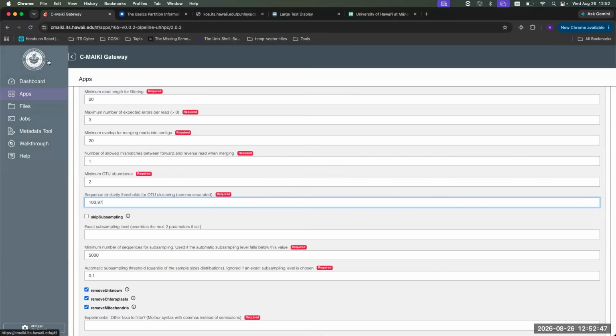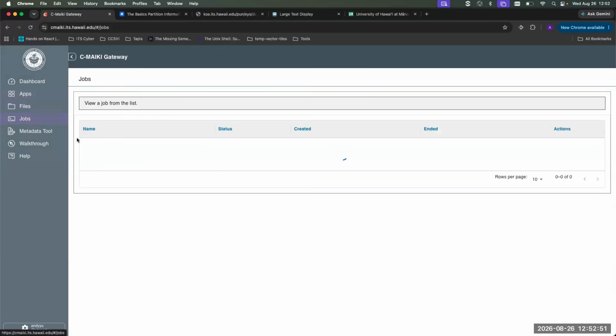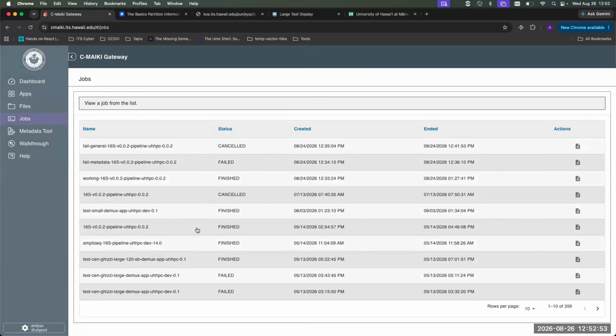Cool. From there, once you submit a job, it'll join the queue. It'll present here in your jobs list. It'll give you pending statuses, so whether it's setting up, staging, running, finished, etc. As you can see here, I only have completed jobs. Failed will show, okay, something went wrong. Time to investigate. Finished is, of course, your pipelines reach the end.